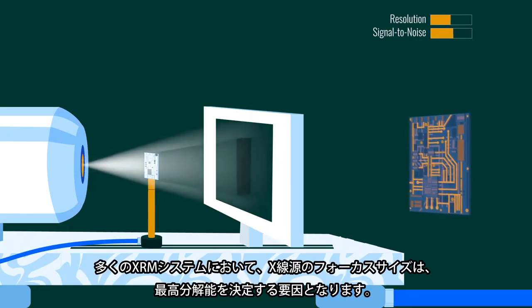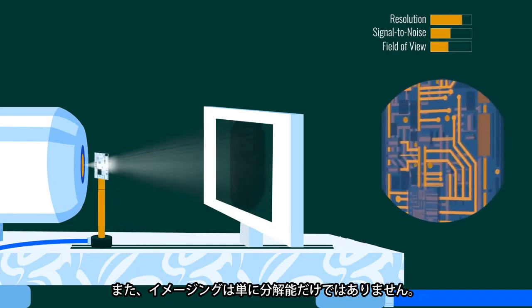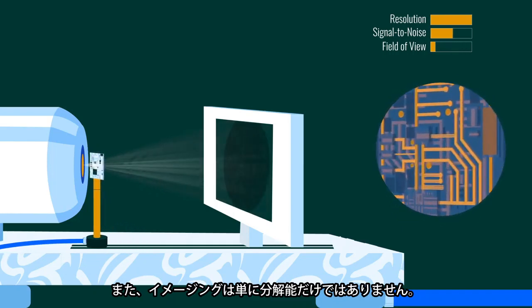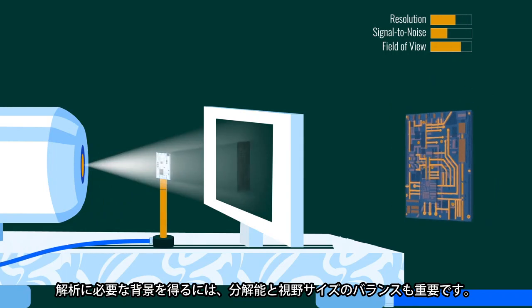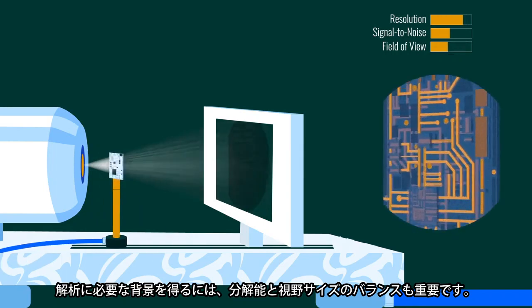Source focus size is ultimately the resolution limiting factor in most systems. For a typical experiment, this is on the order of several microns. To obtain sub-micron resolution, a specialized source with small spot size is required. It is also important to remember that imaging is more than just resolution. Balancing resolution with field of view is also important in bringing sufficient context to the analysis.